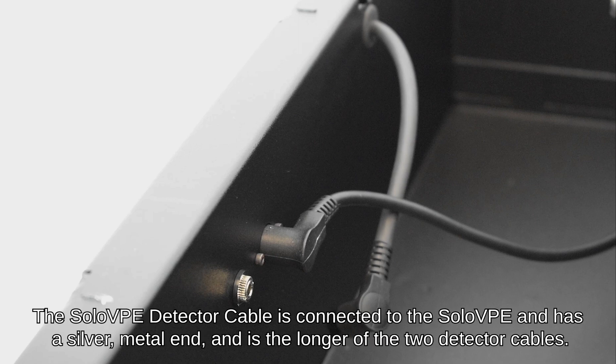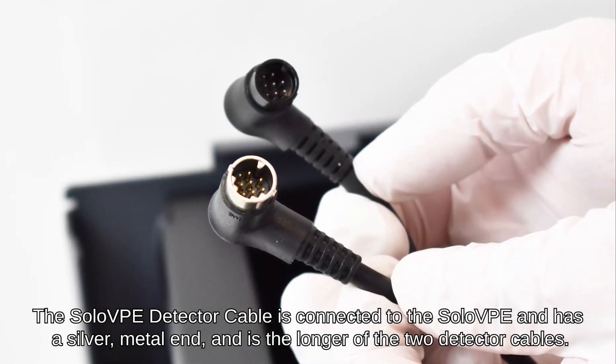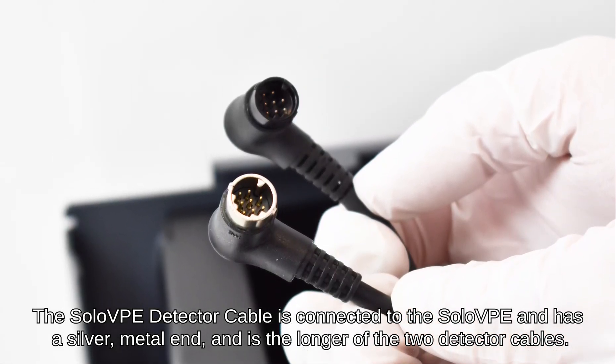The Solo VPE detector cable is connected to the Solo VPE and has a silver metal end and is the longer of the two detector cables.